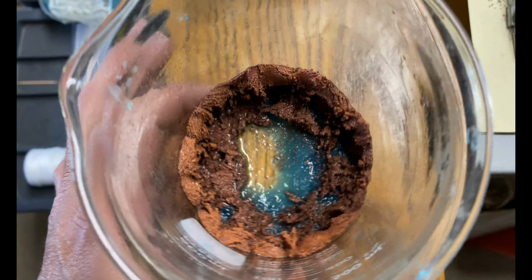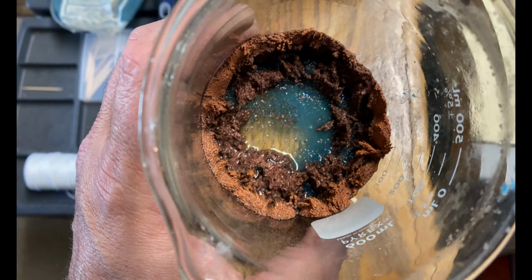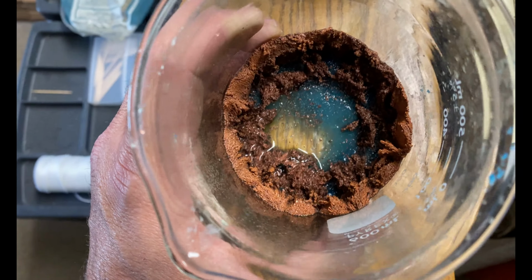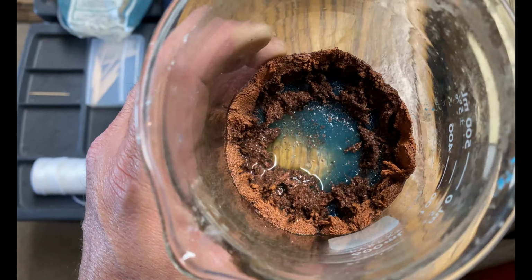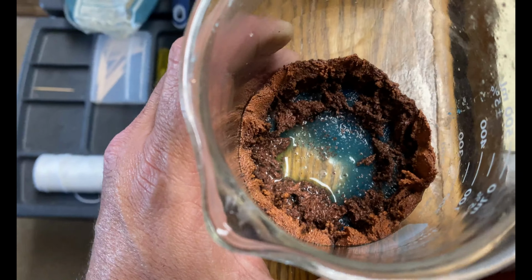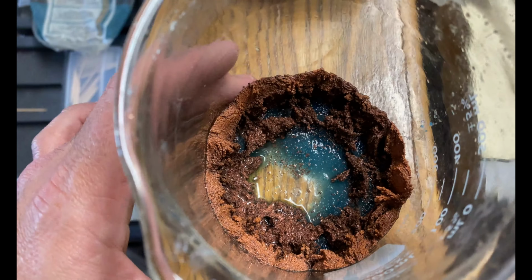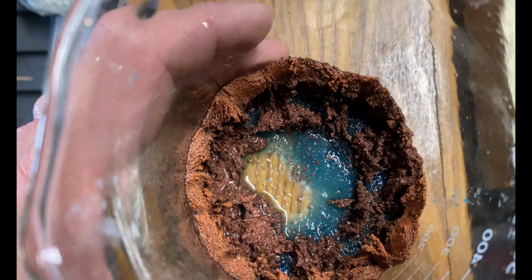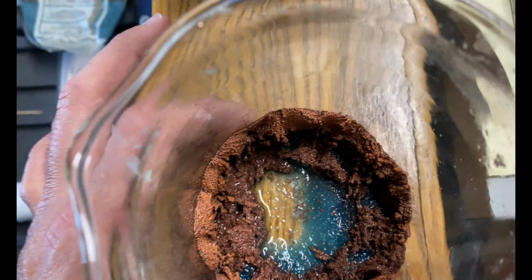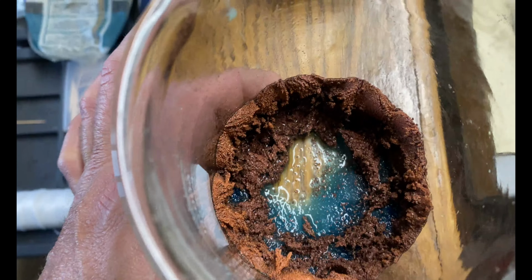I would call this reasonably successful. I've diluted it many times to get the remaining blue vitriol out. The reaction was incomplete, so there's still some magnetism left here. I've removed the magnets, but you can see the imprint of the magnetic field, and it did retain a solid shape. It's not very strong, but it did form to a solid shape.